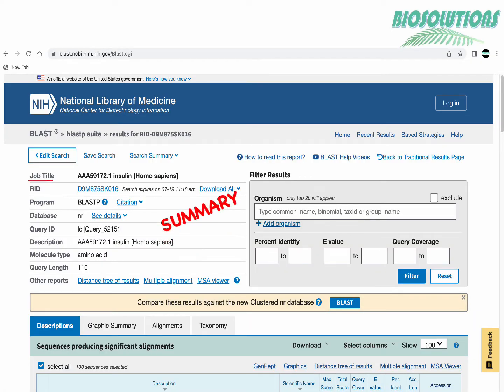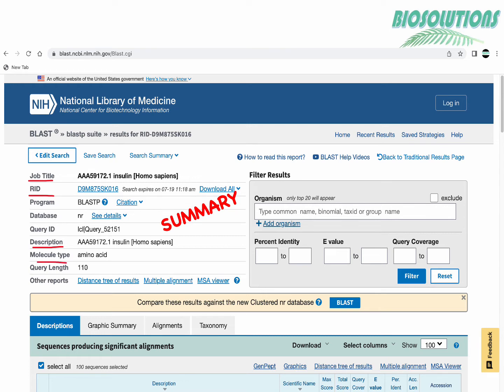Job title shows the first query sequence ID by default which is AAA59172.1. Here our ID shows the assigned unique identifier to this search and molecule type is amino acid sequence and the query length is 110 amino acids which is the length of our chosen sequence.